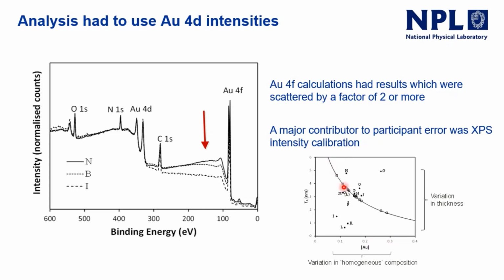Now, if you did the calculations right on shell thickness, it should follow this line to translate into a thickness. Let's not talk about the way people did calculations. That wasn't very consistent either. So we got this huge range from less than a nanometer, and I haven't shown you the one that was about 50 nanometers because that just defies physics, to be honest. But I think that's just about guidance and having some tool to do the calculation.